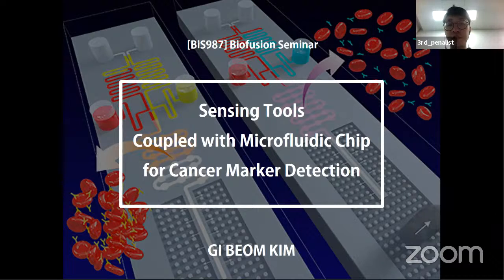So I'm going to introduce you to some of the ways in which you can combine the filtered cancer markers with microfluidic chips. I'm going to introduce you to some measurement methods and some examples that are relevant to the method.